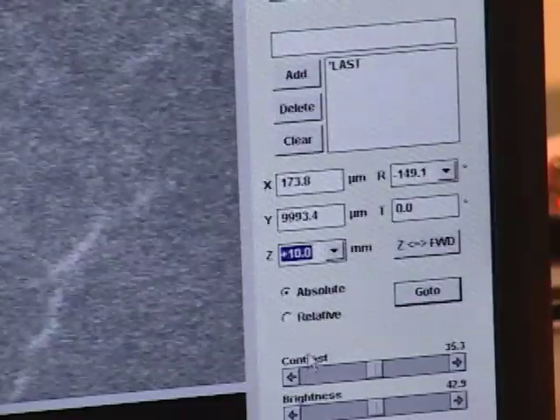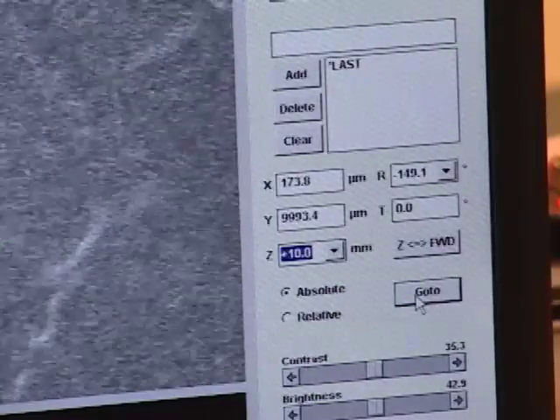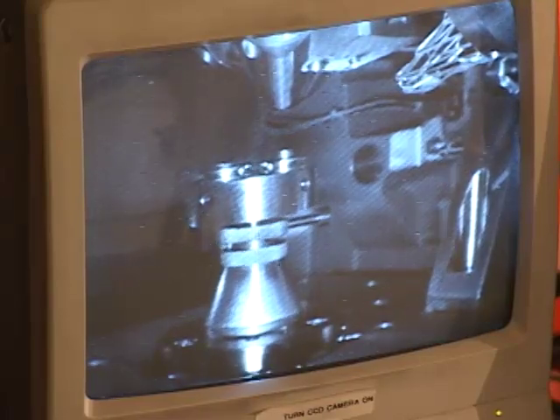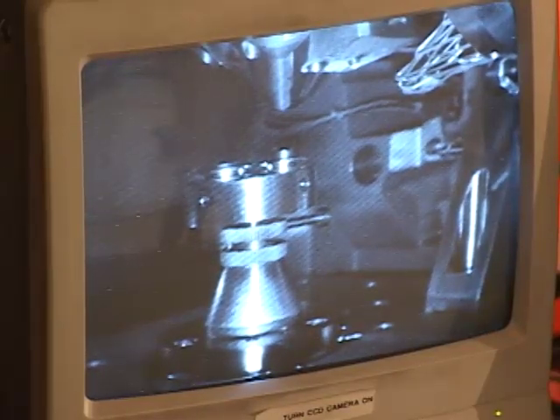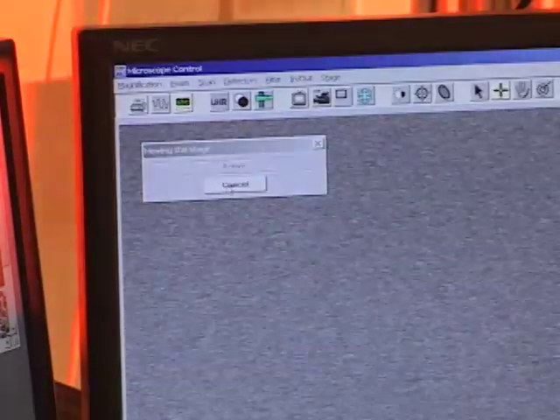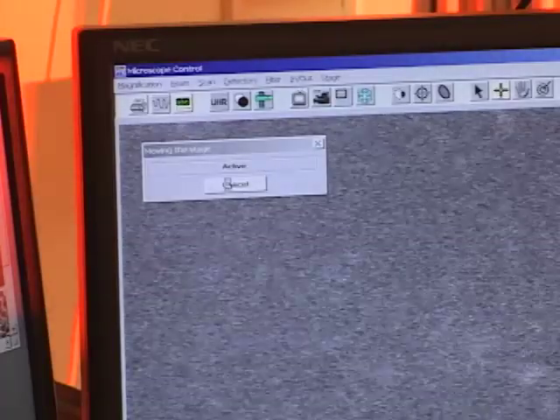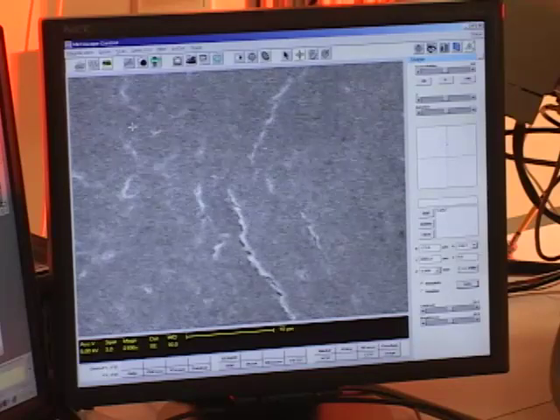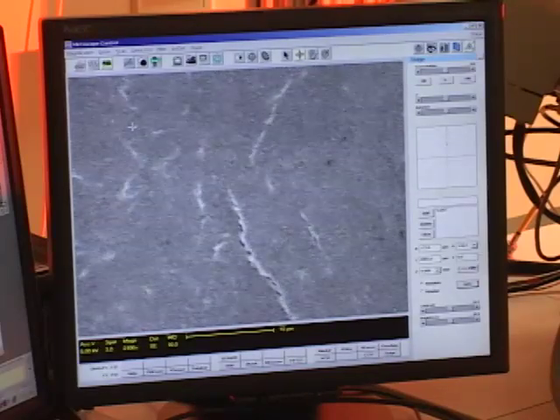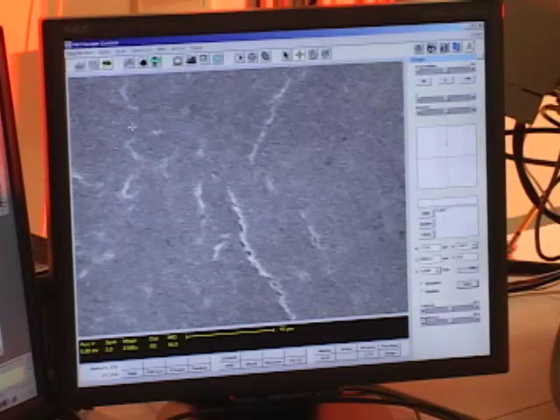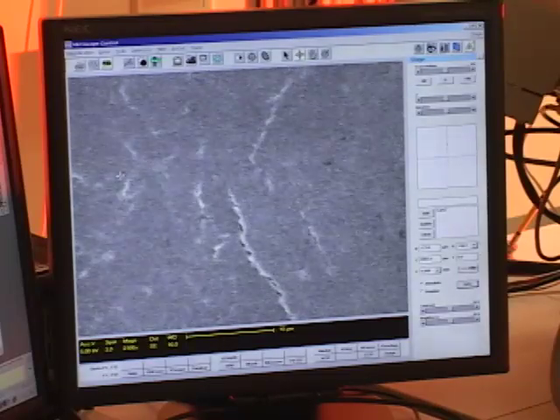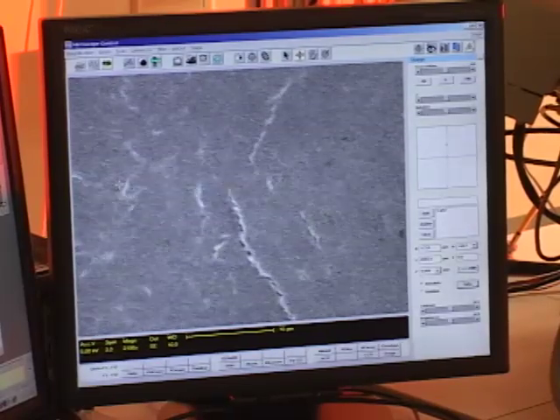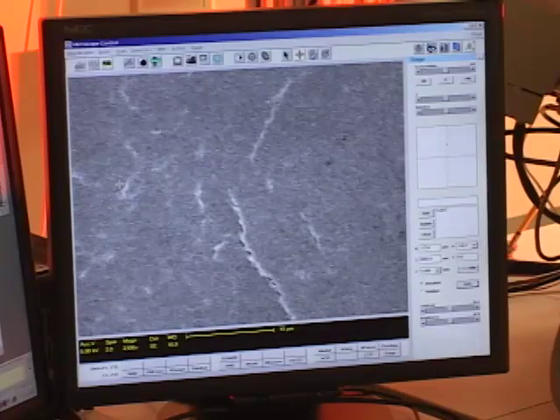And then to initiate the move, I click on this go to button and I move the mouse to the upper left corner and watch on the CCD camera as the sample approaches the detector. If the sample gets too close to the detector, there's a cancel box that will open in the upper left corner and I want to be ready to click on cancel so that the sample doesn't actually impact the detector. If you're careful about following the protocol and the sample is in focus before you move it, you shouldn't need to cancel the vertical movement. But in case there's a problem, you accidentally focus on the wrong part of the sample, for example, you want to be ready to stop that vertical movement before any damage is done to the machine.